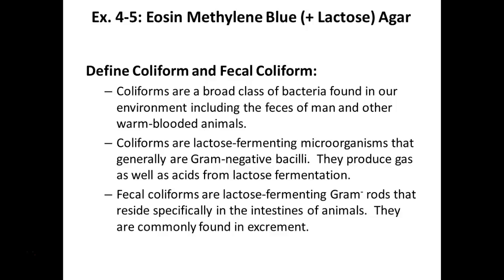Coliforms is a broad classification given to organisms that are found in the intestines of warm-blooded mammals like ourselves. They tend to be lactose fermenters, hence why there's lactose in this media. They're gram-negative bacilli, and they produce acid and gas from fermentation of lactose.